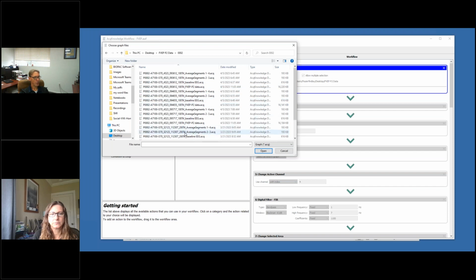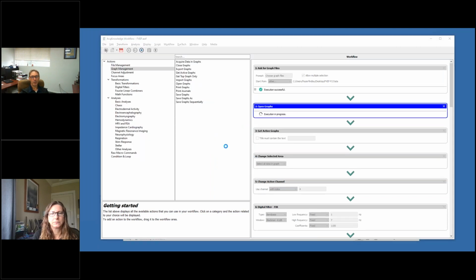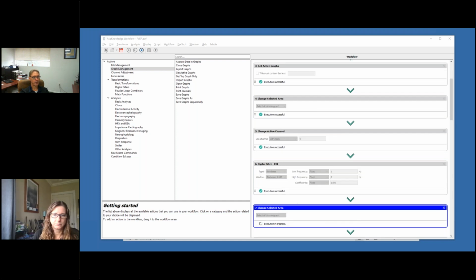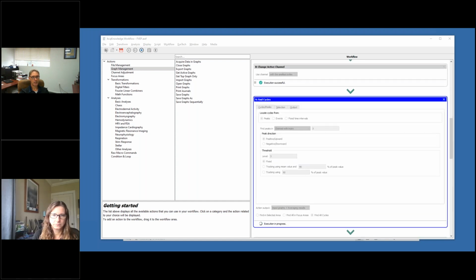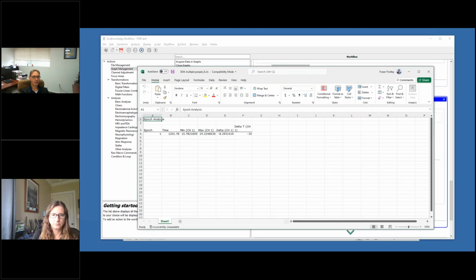So I'm going to open, using multi-select. I'm using the control key, and I'm just opening 4. Now the system will run through. You can't see this because I've got 2 monitors. It's opening the files on my other monitor, and it's now running through the analysis. And I'll bring the files across when we're done. But the key point will happen once it's finished.